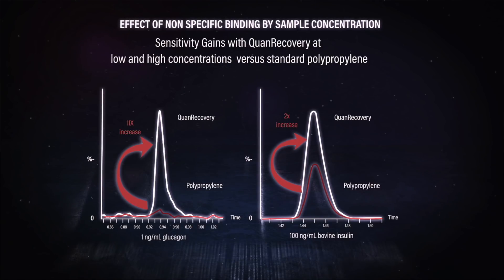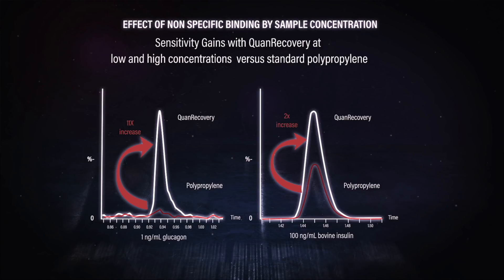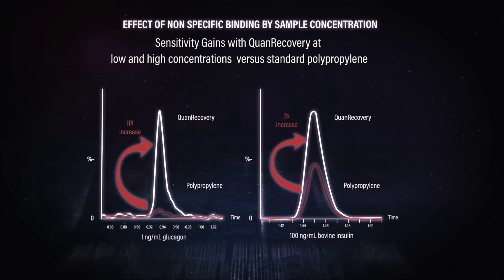So even at higher concentrations, you've got to think about nonspecific binding, because all of that leads to variability problems and difficulty getting reproducible results you can trust. You can imagine this would change how much you lose to nonspecific binding over time as well — from injection to injection, analysis to analysis, you're going to get variability even at a high concentration. An optimized container is definitely key here.